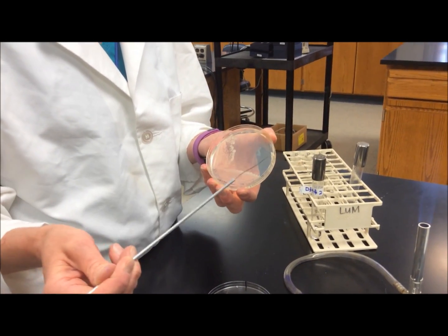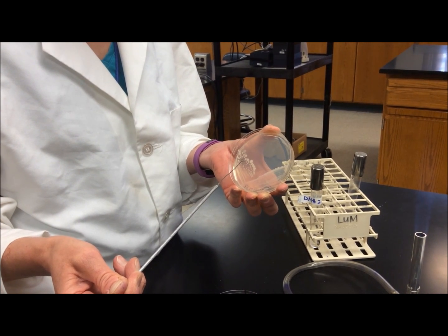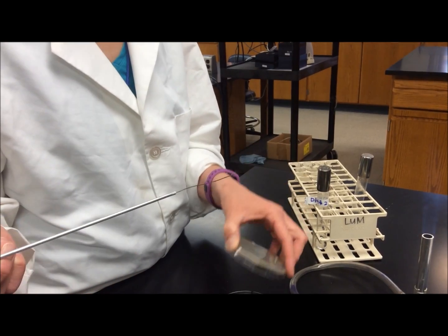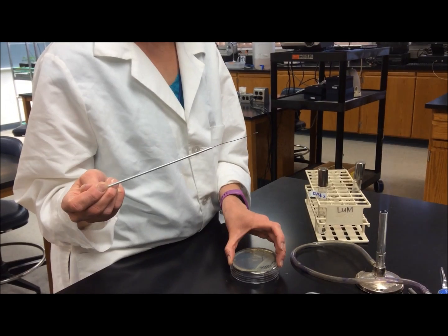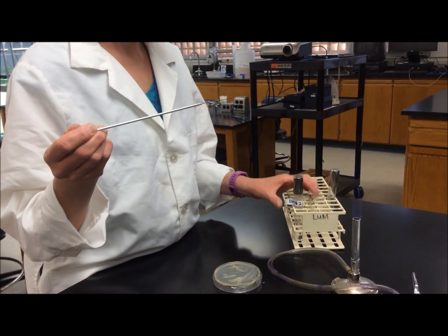It's really important when inoculating liquid cultures to grab a single, well-isolated colony, because once the bacteria is growing in liquid culture, you won't be able to see if there's contamination. It doesn't take a lot of bacteria to inoculate a liquid culture, so you can grab a single colony and then place the plate on the table.